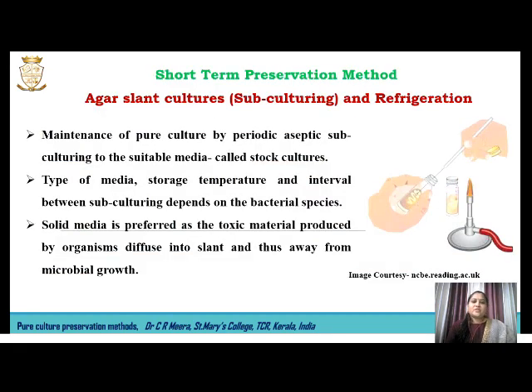Coming to the first short-term culture preservation method, subculturing and refrigeration is the most common type of culture preservation method practiced in most microbiology laboratories. Here, we periodically subculture the organisms onto suitable culture media, and we call these the stock cultures.